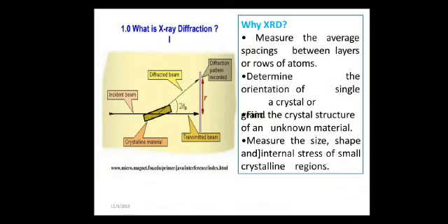beam at a given angle, while the X-ray detector is mounted to an arm to collect the diffracted X-ray and rotates at an angle of 2 theta. The instrument used to maintain the angle and rotate the sample is termed a goniometer.